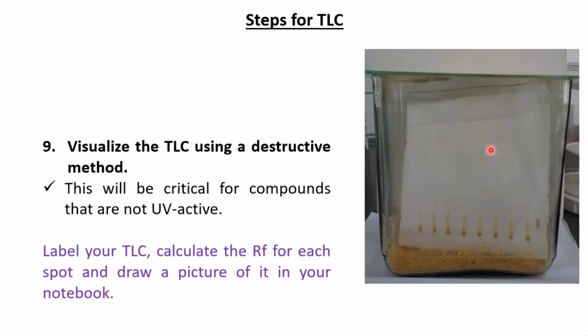So after using the iodine chamber, you can't bring this back to the UV lamp for visualization. However, the non-destructive visualization technique, which is the UV, can be used first, and then we can bring our plates into the iodine chamber for the final visualization technique.